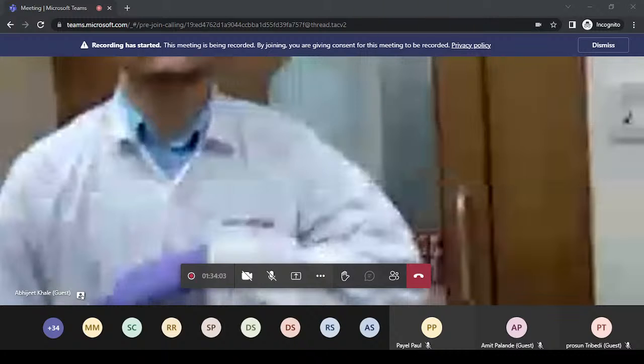Just open the shutter of this Scanner 4, press the load button, the stage of Scanner 4 will come out, and on the stage we can keep the plate for scanning densitometry. And again press the load button, the plate will go inside, close the shutter. All the things we can control through software. In software, we need to put which lamp we want to illuminate, which wavelength we want to generate to scan the plate, in which range we want to capture the absorption spectra. So basically, it will generate a chromatogram, absorption versus Rf value response.